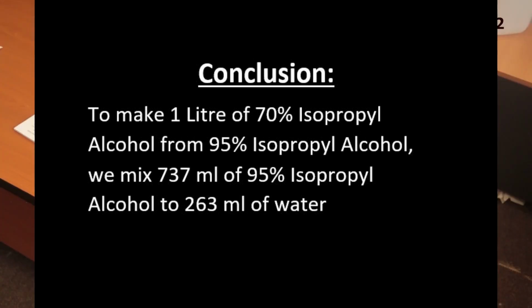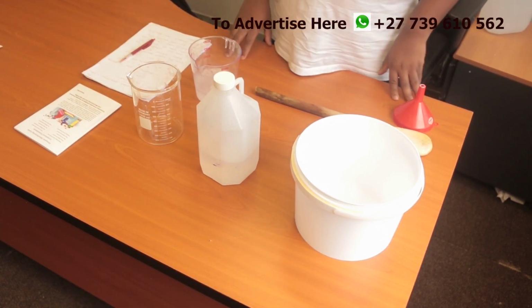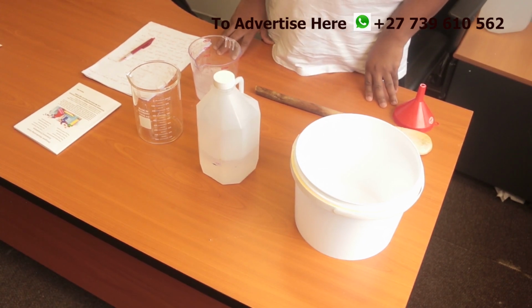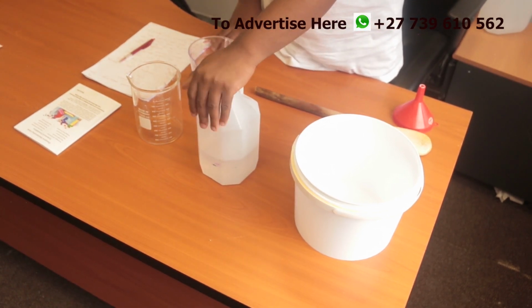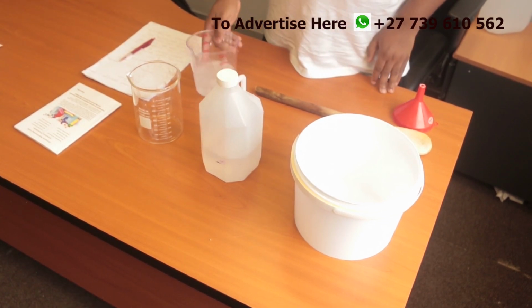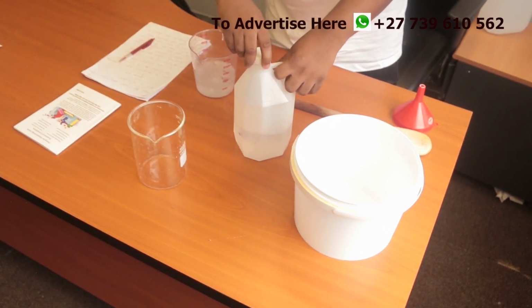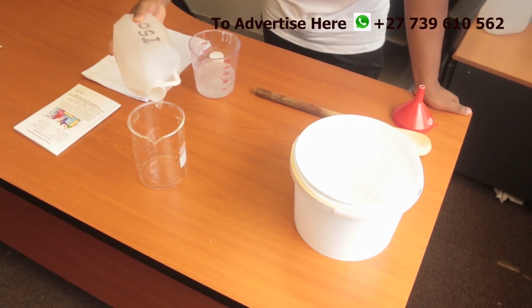Let's do the mixing. This is my isopropyl alcohol, 95%. I'm going to use it to make 1 liter of 70% isopropyl alcohol. Remember that I've demonstrated everything. You actually need to mix 737 ml of 95% isopropyl alcohol with 263 ml of water, then you can get your 1 liter of 70% isopropyl alcohol. So the first thing to do is to measure an amount of 737 ml of 95% isopropyl alcohol, which is what I'm doing now.